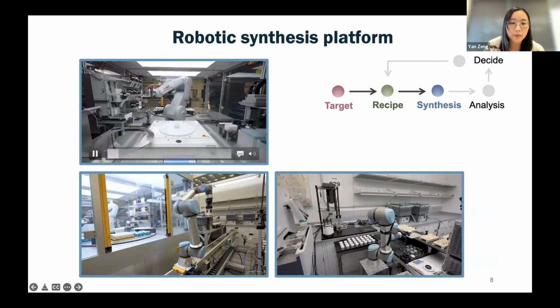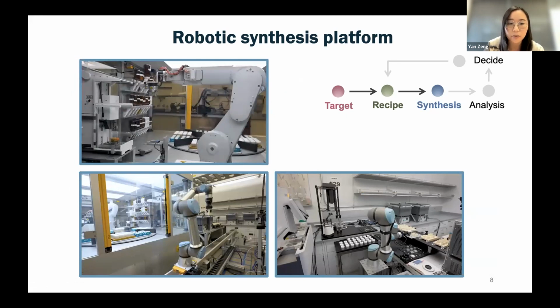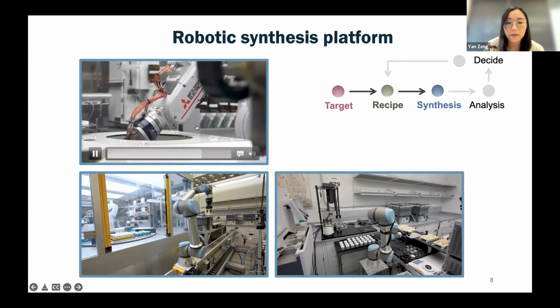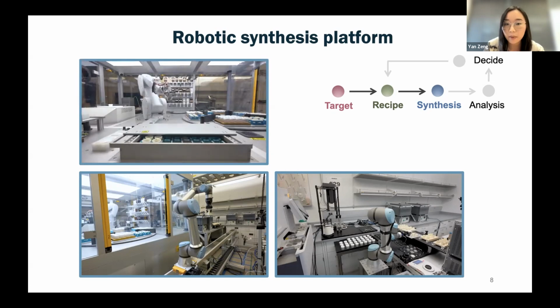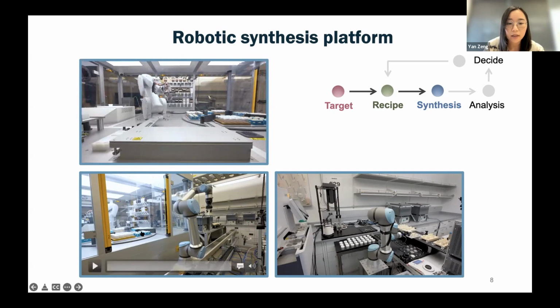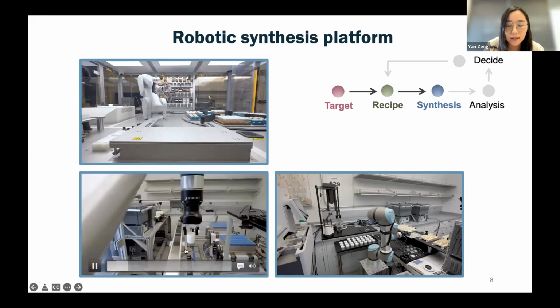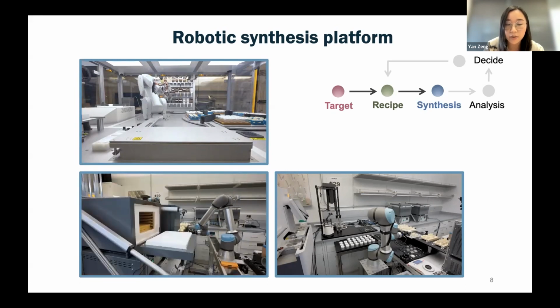It starts from this precursor powder dosing. This first robot takes the consumables from the loading zone, and then the automatic balance will start dispensing different kinds of prescribed powders with their certain amounts. Now it handles another powder and then performs a mixing of the powders with a little bit of solvent. After that, it dries out the solvent in a crucible that can then go to one of the furnaces. So the second robot arm waiting outside takes the crucible and travels all the way to the pre-assigned position for this certain crucible, and then hands it over to one of the furnaces.